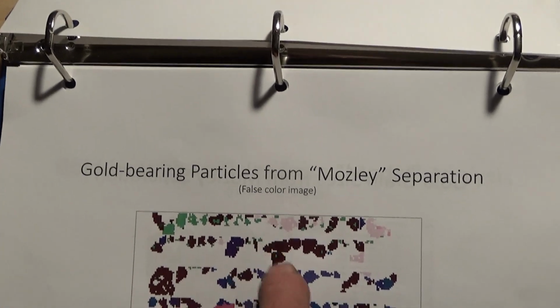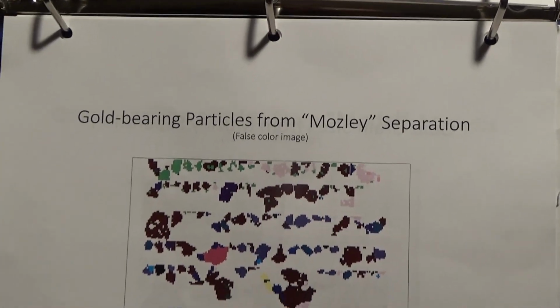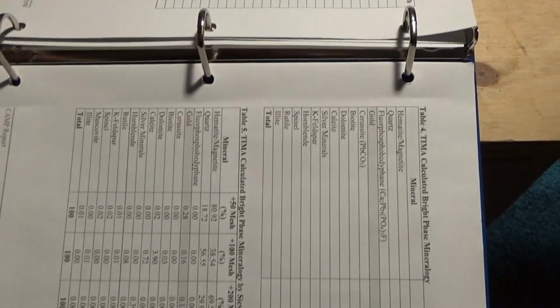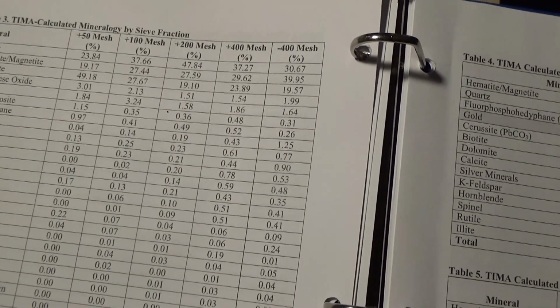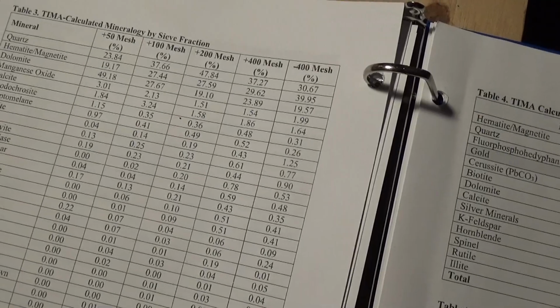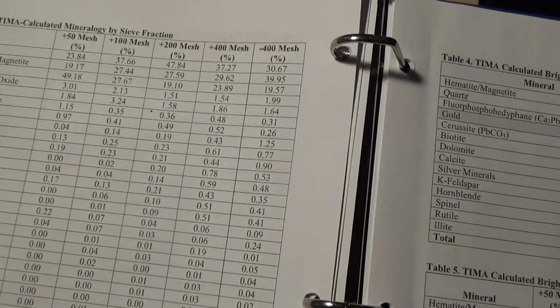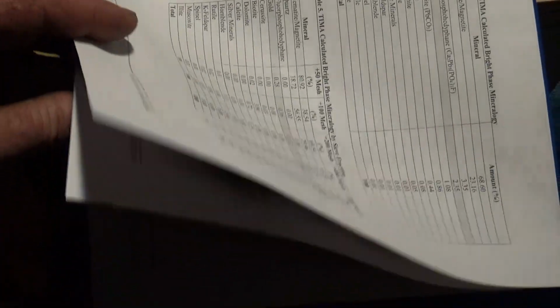So that's basically where the gold is. Primarily it seems to be in the iron oxide. So we're looking at concentrating the iron oxide. Here it gives you some of the percentages of the various minerals in this particular ore, or actually this particular sample of this particular ore. This lets us know, which wasn't surprising, that the quartz and the dolomite are tougher than the iron oxide in general. The iron oxide tends to crush fine a little easier, which may be useful.